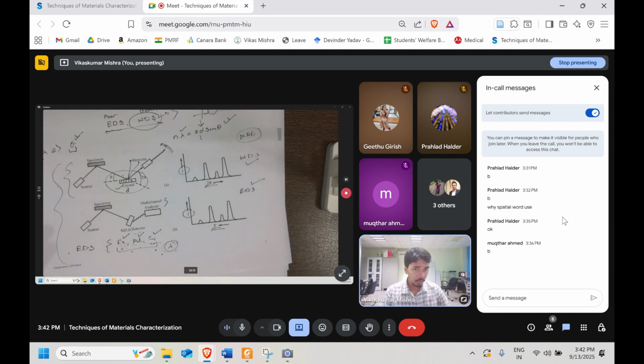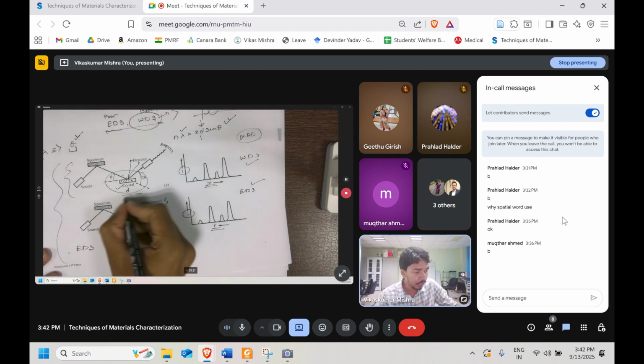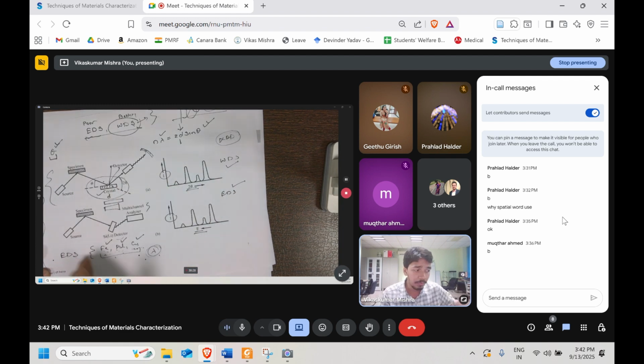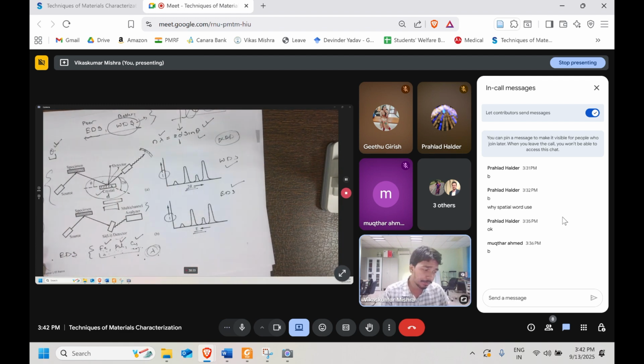The entire heart of this particular detector lies over here, this crystal which you are aware of. Now, it's not that we are only using one crystal, multiple crystals can be arranged and they can correspond to different d values, and so different elements will have different theta. Okay, so this is the information that we need to be aware of.